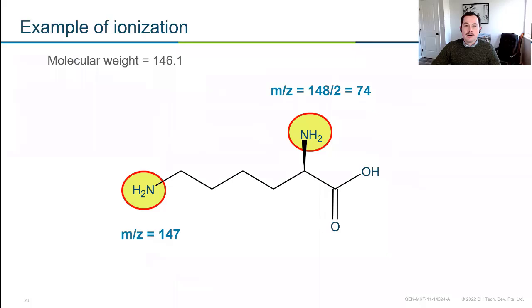Just a quick example of a compound of interest. This compound has a mass of 146. If we're doing positive ionization, here we would see a mass of 147, so we're adding a +1 in this case. If we had a doubly charged ion, we'd see this divided by 2. So instead of seeing a 147 or a 148, because it's two of the hydrogens, we'd see a 74. When you're dealing with larger molecules like proteins and polymers, understanding charge states is really crucial because you need to know what mass to look for.